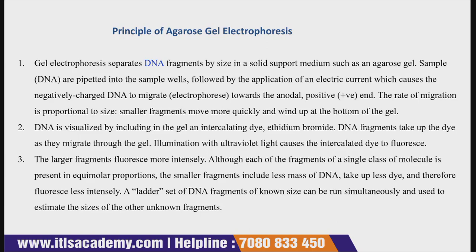So how does it work? Gel electrophoresis does the separation. It separates the DNA fragments. How does it separate them? Generally by size in a solid support medium. Which type of solid support medium? Agarose gel. The sample, meaning the DNA, is pipetted into the sample well in the agarose gel, followed by an electric current.